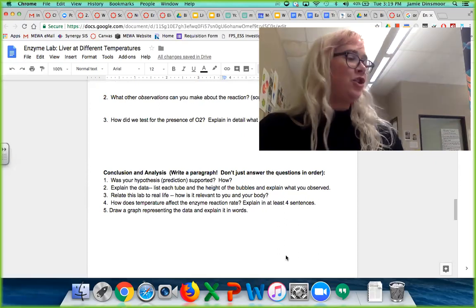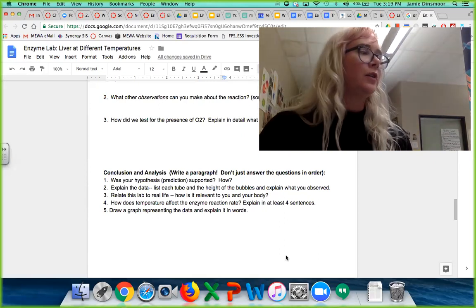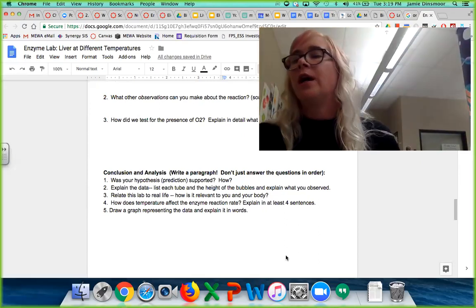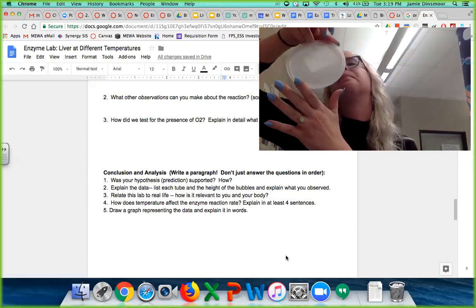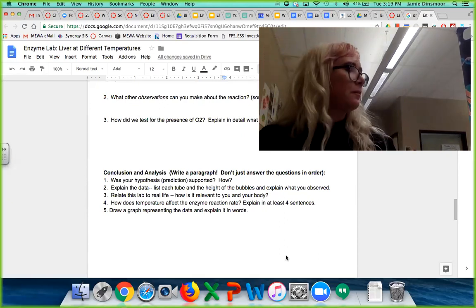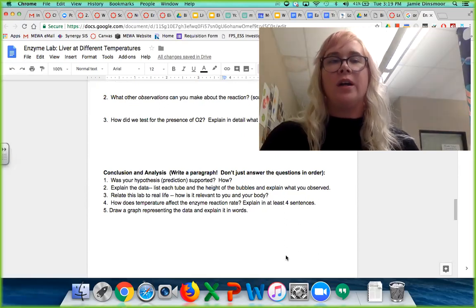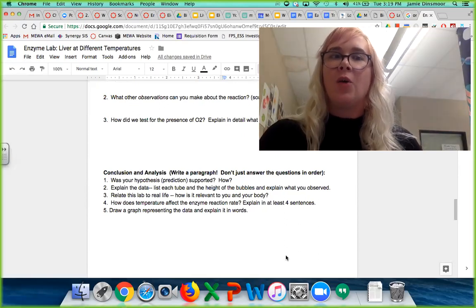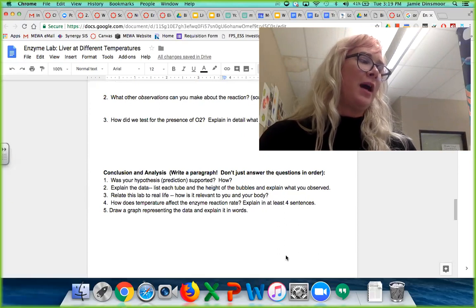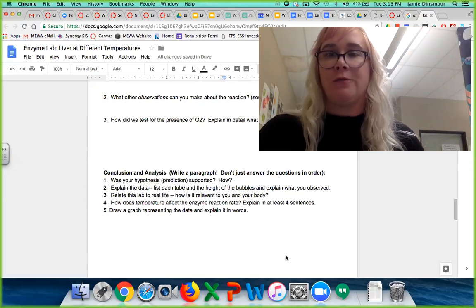They were organic and GMO free. Yeah, I don't know if these livers are organic livers. I don't even know if you can make a liver organic. Let's see what the packaging says. Nope, it just says Pacific Northwest grown right there. All right, so they're local. We've got one mark. Were they? Yeah. Well, I think they came from actual chickens, I'm assuming. But I guess you could grow a liver in a dish if you wanted to.